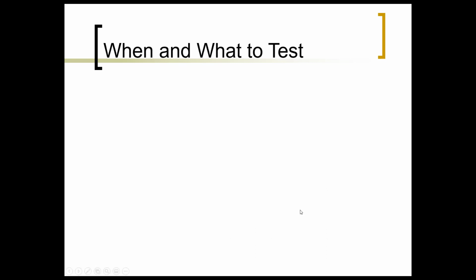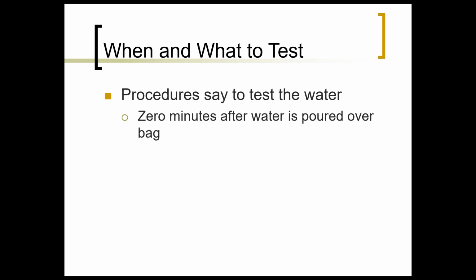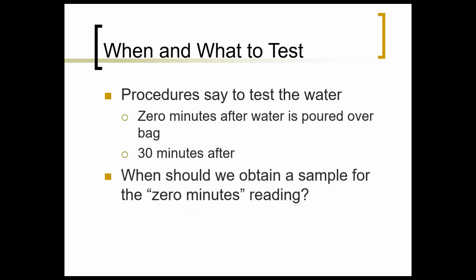A reasonable question at this point would be to wonder when we should test the water outside of the dialysis bag. Now, the procedure for the experiment tells us that we should test immediately after the dialysis bag has been immersed in the water, and then after 30 minutes have passed. This procedure, as given, is easy for us to follow. However, testing the water after the dialysis bag has been placed in it totally defeats the point of trying to test the water at the true beginning of the experiment.